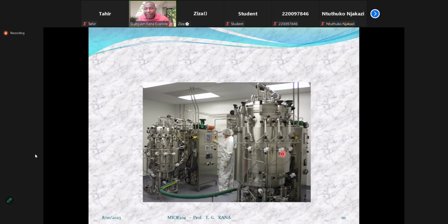The other part, actuators act. That is, actuators carry out a kind of action on the reactor. You have, for example, the motor that will rotate to mix the content, which is an actuator. The valves that open to allow a given feed or nutrient to go into the reactor, these are actuators. That is, it has a number of sensors that will sense the environment and the actuators that will act. Okay.